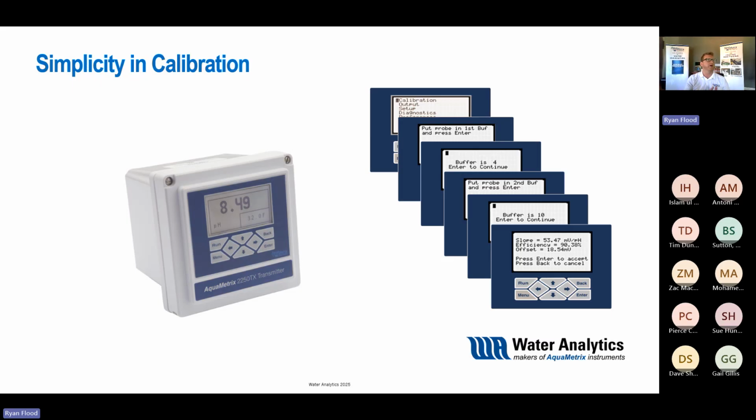If you can have a controller right nearby that can perform calibration, that may help. Now, it doesn't have to be a controller per se, right? An analyzer can also perform a lot of these same types of functions of performing the calibration directly there and then sending that signal off to where it needs to be, or again, just being a local display.